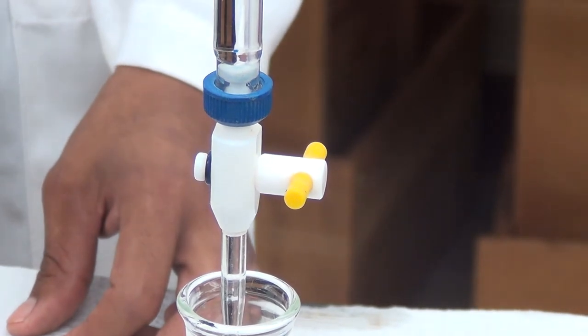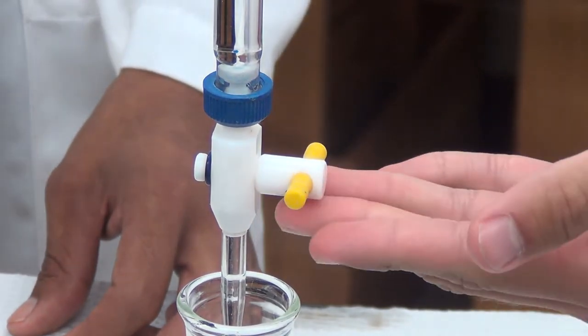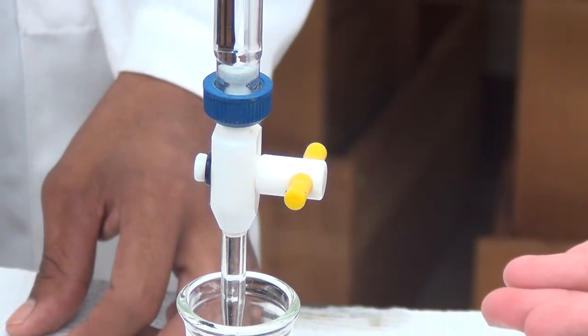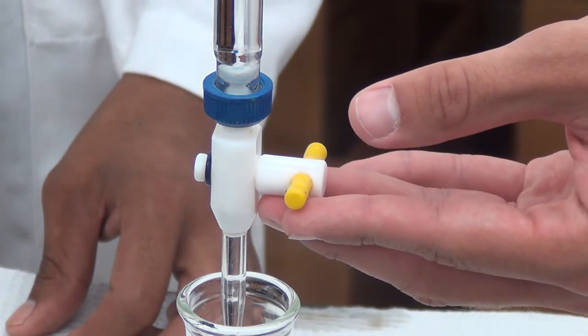The stopcock is a valve that allows control over the rate at which the liquid is dispensed. With the handle perpendicular to the body, it is closed. Parallel, it is completely open.